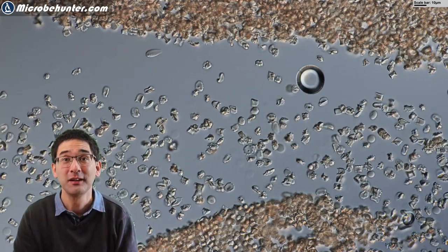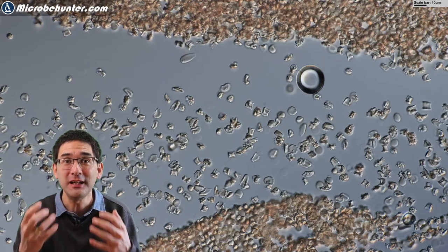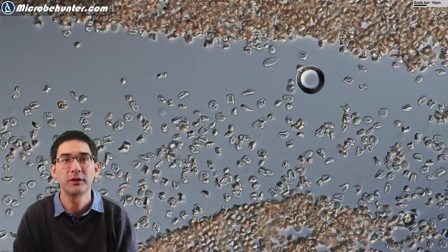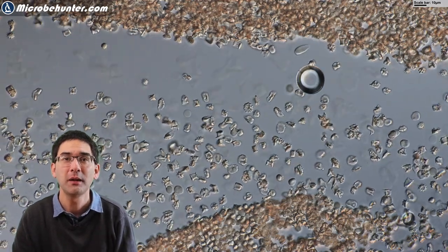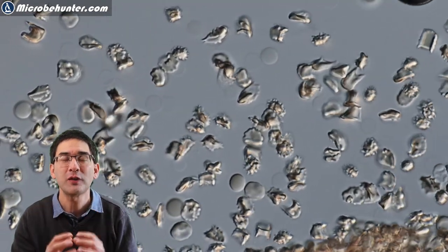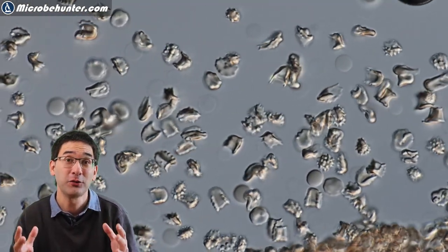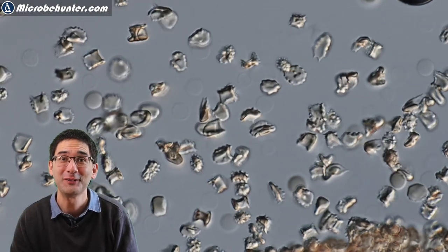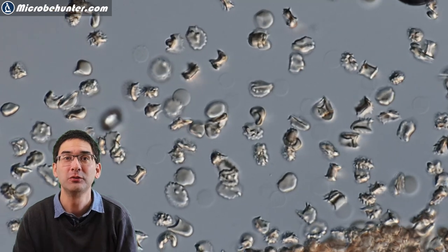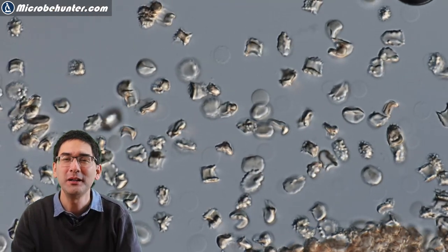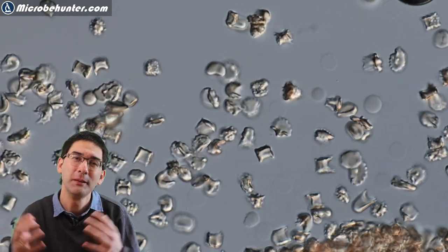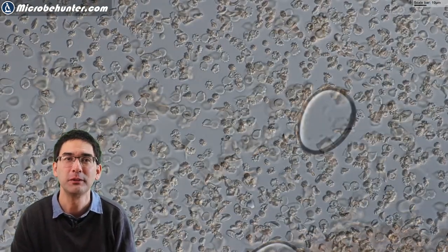I personally think that blood is a very interesting thing to observe. If you have a bright field microscope, you can also observe the blood cells this way. I would recommend that you close the condenser quite a bit because the contrast is not very high. As a matter of fact, you probably have already noticed the color is not red. Blood only appears red when you do not look at it under magnification. If you zoom in a lot, then maybe a small pinkish tint you're able to see, but generally the red color is not visible anymore.